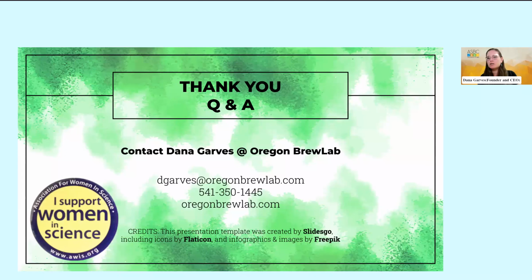It is something that I've looked at, but disposing of my isooctane waste here safely is very cheap. I've never spent more than $27 on, I think, 8 to 9 liters of it. It is something that I'm interested in implementing into my lab, but I think that there are some safety considerations when you have a separatory funnel full of isooctane just hanging out in the lab, that leaves me pause.